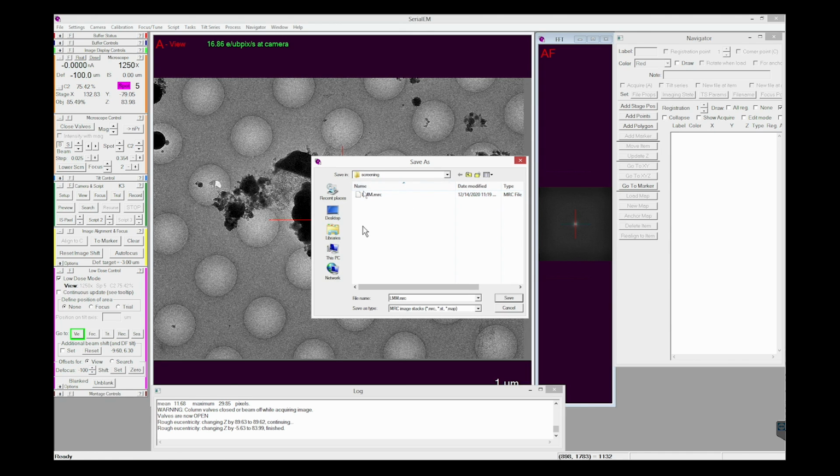And you can see I have LMM already here. I should talk about where to store. So you want to go to our Z drive and then raw data, PNCC, and then your project ID. For us, since this is an internal training, we're going to use our internal project ID, which is 50414. If this is your first time on the microscope with your project, you'll need to create a folder at this point. So if you don't see it, just make a folder.